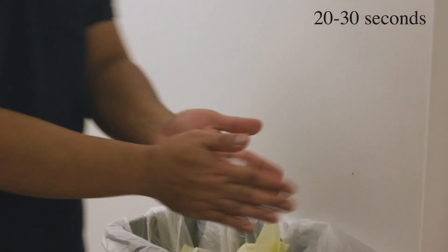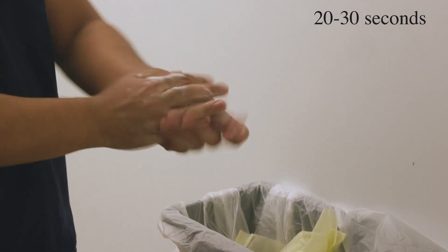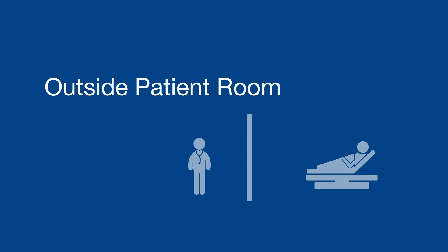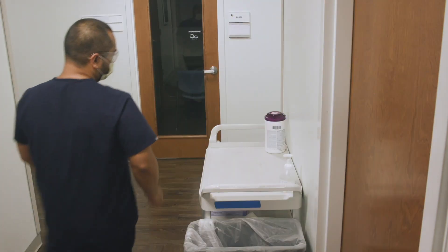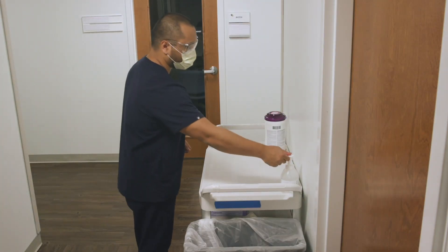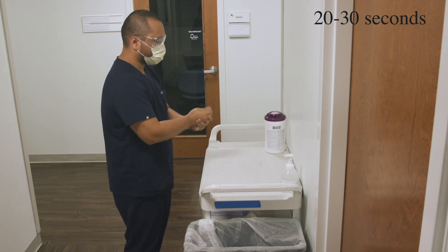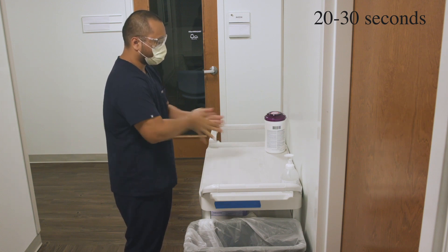Sanitize your hands very well. After taking off your gown and gloves and then exiting the room of a patient with a confirmed or suspected COVID-19 case, sanitize your hands very well.